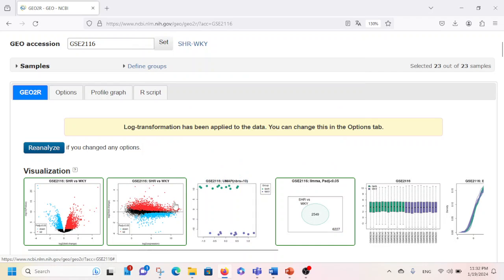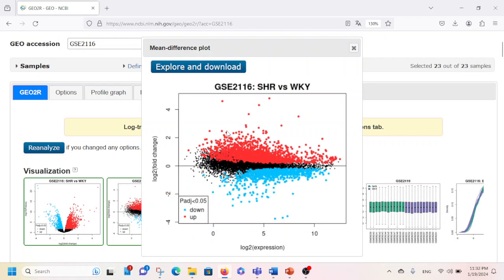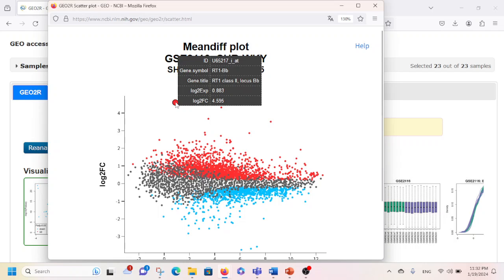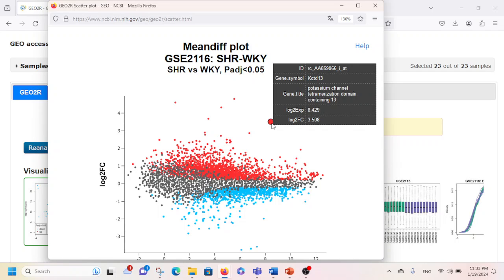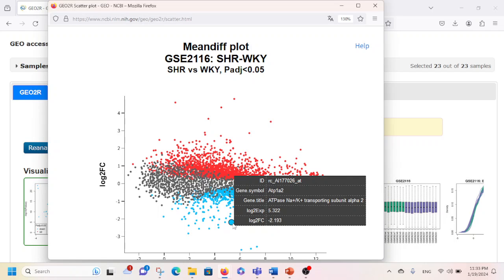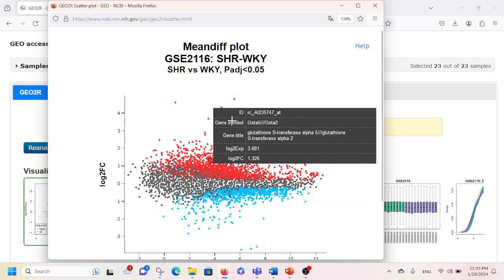I'm also going to close this window and then click on another graph. This graph is called a Mean Difference Plot. Again, downregulated genes are shown with blue dots whereas upregulated genes are shown with red dots between these two groups. If you want to explore further, click here and you can hover your cursor over the dots — for example, one gene shows RT1-BB, another shows KCTD13, and for the blue ones a gene here is ATP1A2. You can explore each and every different gene by moving your cursor around.